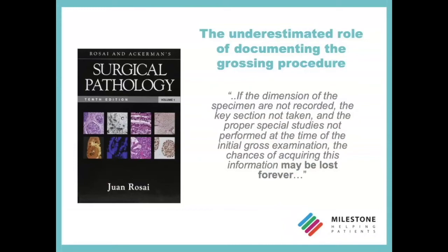I'd like to start with this interesting quote from Professor Rosai about dissection: if the dimensions of the specimen are not recorded, the key sections not taken, and the proper special studies not performed at the time of the initial gross examination, the chances of acquiring this information may be lost forever. So the better and more detailed the description, the better the context of the case under analysis we can provide to the pathologist. The glass slide represents, in fact, only a small portion of the dissected tissue.